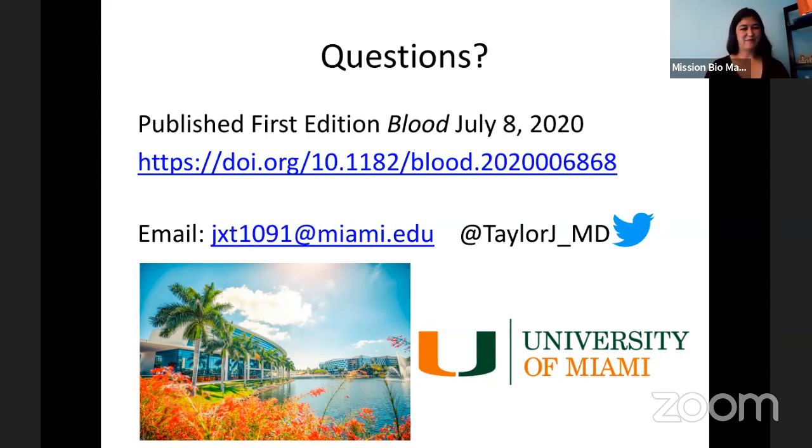That actually leads up to another question. It's great that the Tapestry platform can tell whether these mutations are co-occurring in the same cell, but if you didn't have the Tapestry platform, is there an older technology that you would have had to use to answer this question?